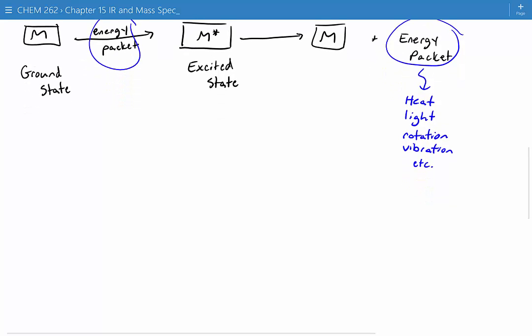All right, so let's delve a little bit into IR spectroscopy. With IR spectroscopy, you generally have some sort of IR source. There are a variety of different IR lamps that you can buy. And what these do is they emit frequencies of light that are all within that IR range. So we've got these different wavelengths, different packets of energy.